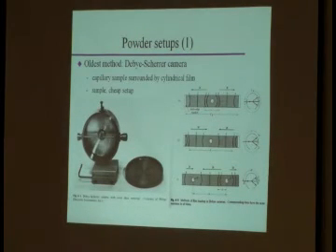How do you set things up? Here's one of the oldest methods. Okay. The Debye-Scherrer camera. It's a circular device. You have a little hole here where you can put a capillary in. That's your sample mount. You have a little collimator so that your X-rays are nicely focused onto the capillary. You have a beam stop on the other side. And then you put a piece of film around the inside of this cylinder, okay? Very straightforward, very easy to machine. Put an X-ray source here, expose it, get your film out, and this is what it will look like, okay?